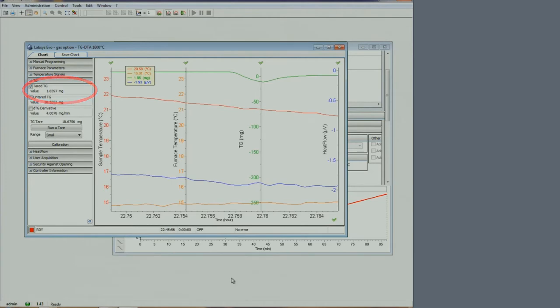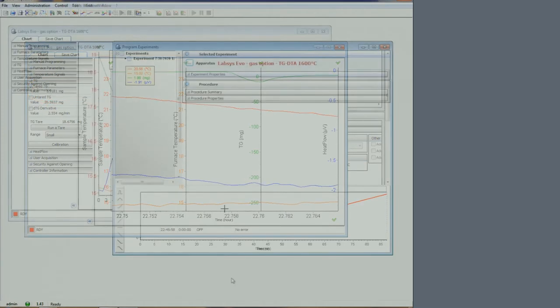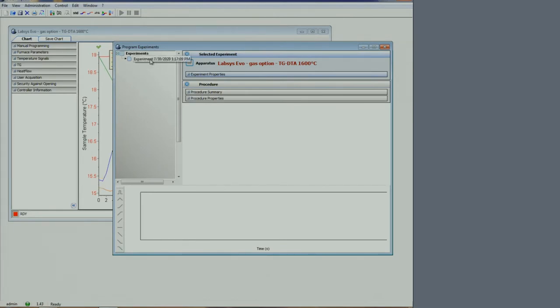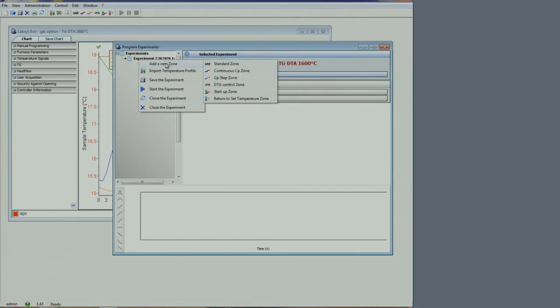We now want to set up a run. To do so, we go to the program experiment window. We see a blank experiment listed. We want to add a new zone. Let's add a standard zone.